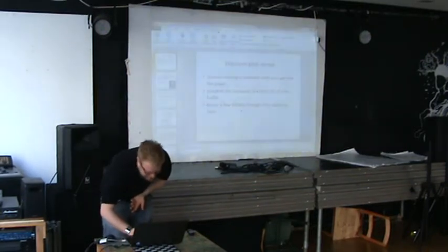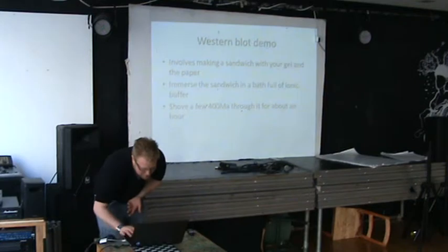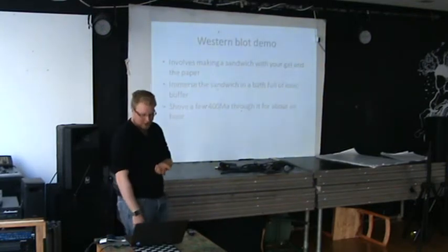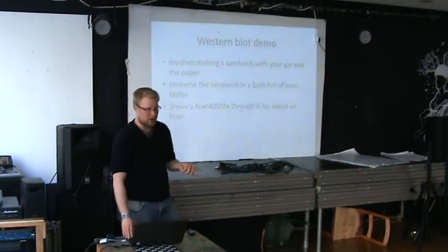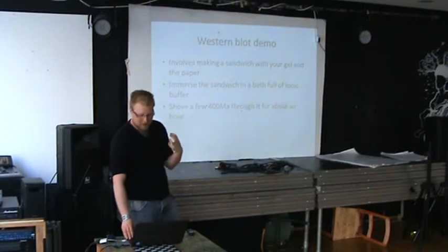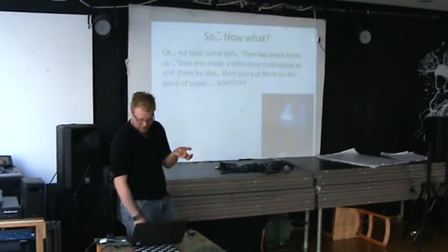Okay, so you're going to put about 400 milliamps through that for about an hour, and then you're going to get all your proteins from your gel onto your nitrocellulose, hopefully, if it works, which it doesn't always.